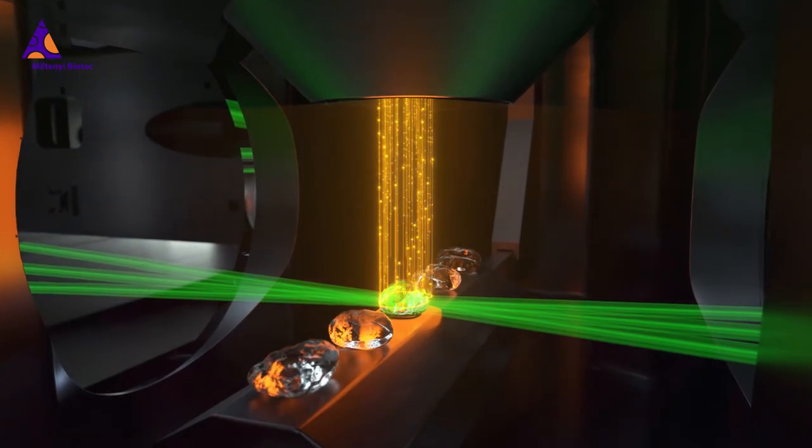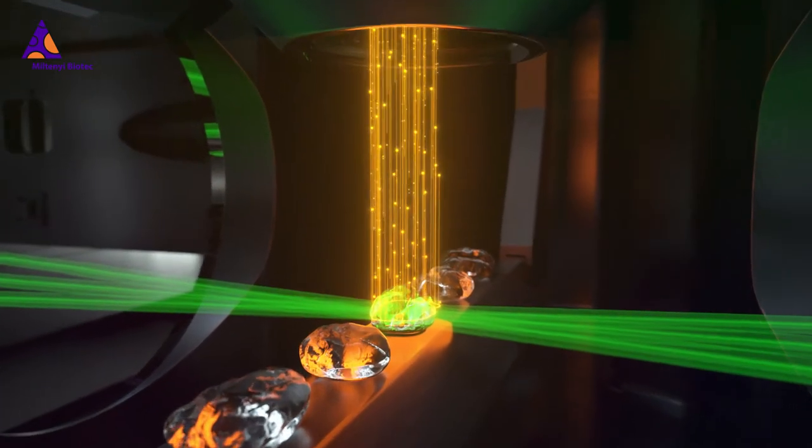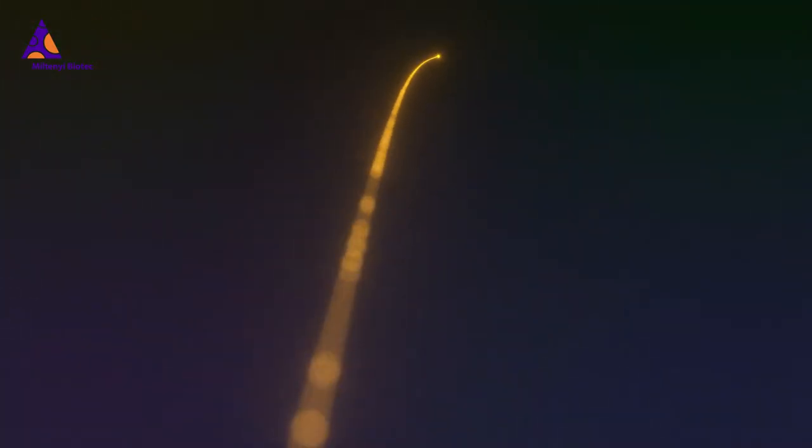Time and again, scientists blast off in new directions, uncovering areas previously unknown to mankind.